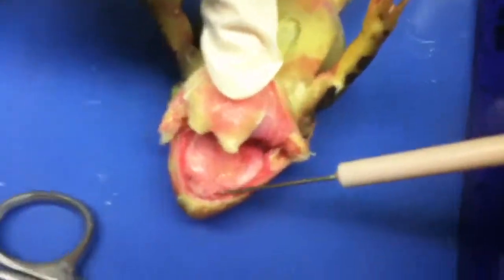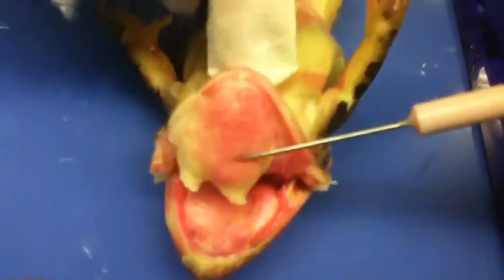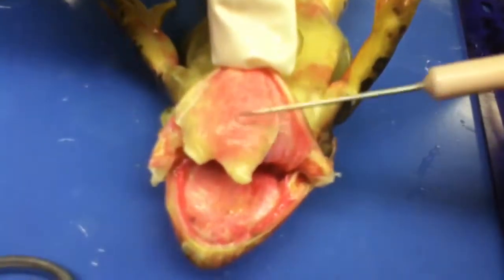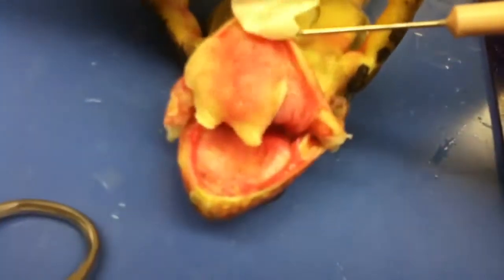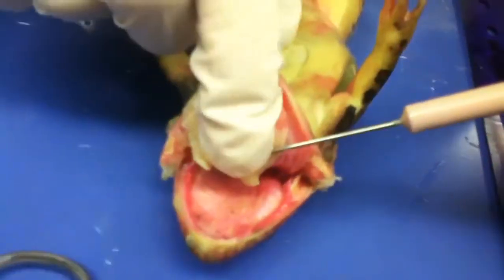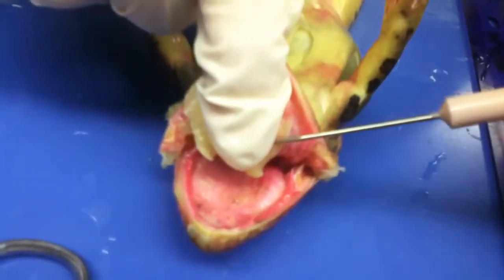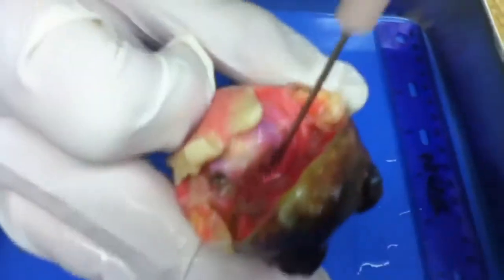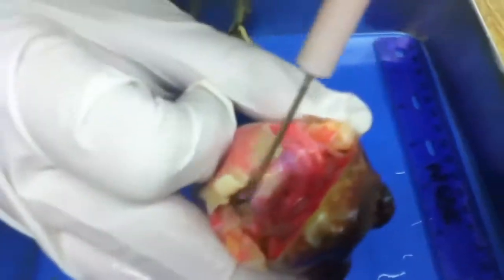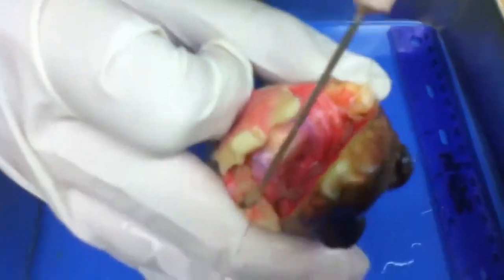Alright, so check. The tongue. Find the tongue. Right here? Is it that thingy right there? Yep, this is his tongue. How does it extend out? Find the pharynx. The pharynx is, well, here's how it's pointing to. Right here. So that would be at the bottom, right here in his mouth. Yeah, the bottom. Yep, it's right here. Look. You can see it, it's right there. You see it? Oh, okay. If you see it, I guess I'll check it off.